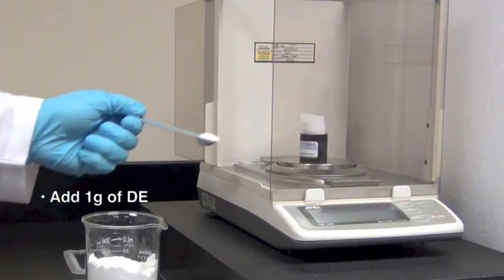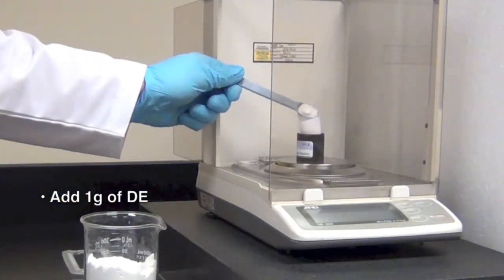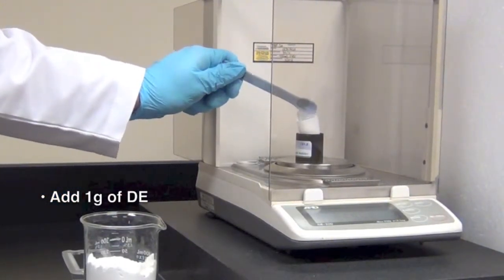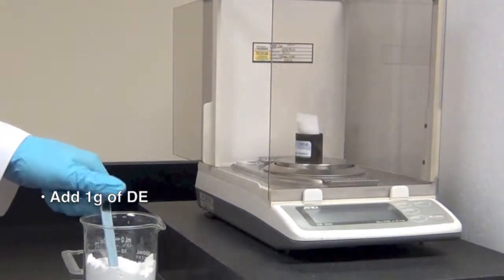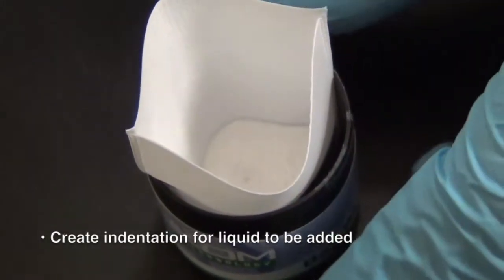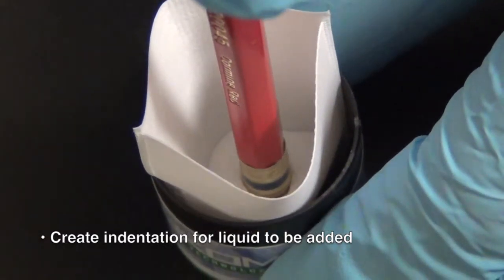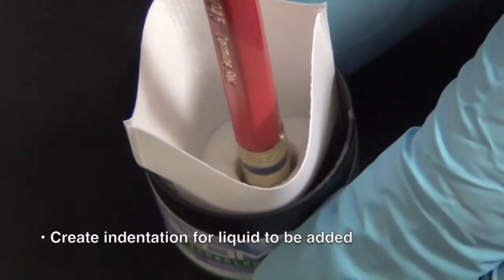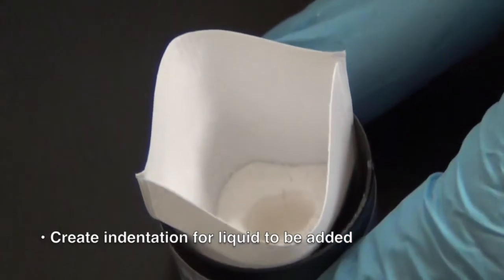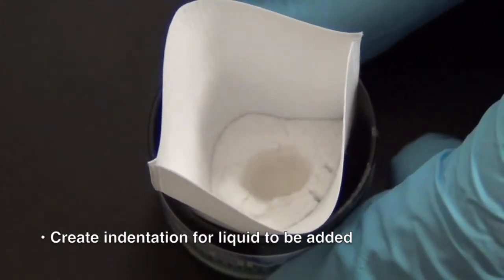Processing liquid samples is very simple. First, add one gram of diatomaceous earth to the filter bag. Press the eraser end of your pencil or a similar sized utensil into the diatomaceous earth to create an indentation into which the liquid can be added using a pipette.